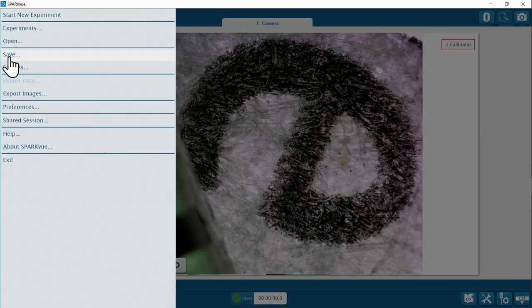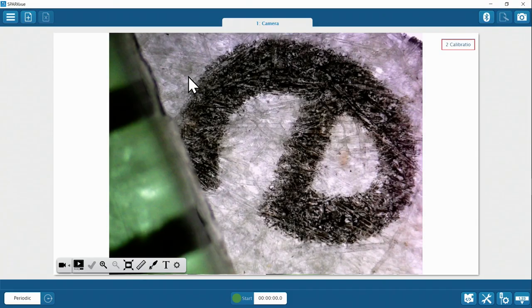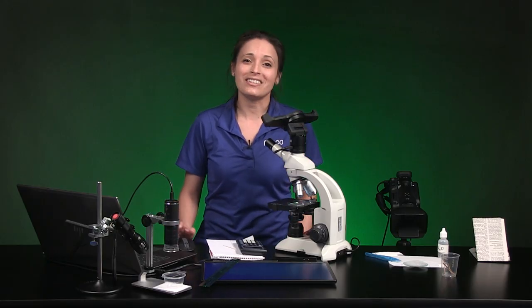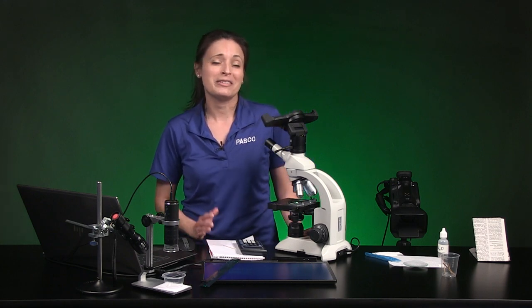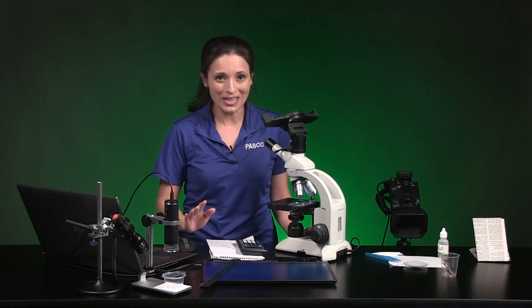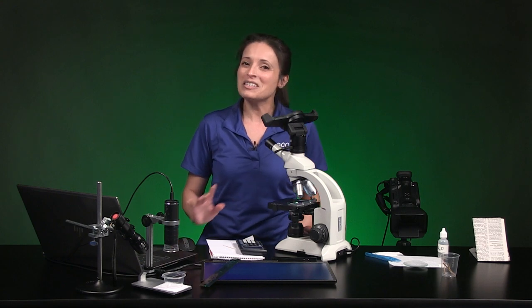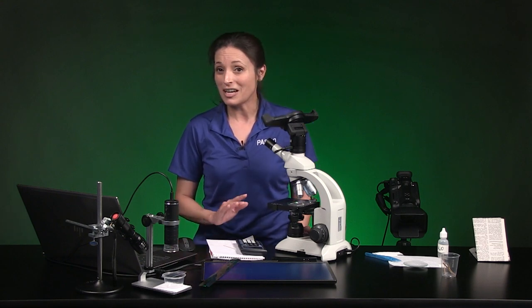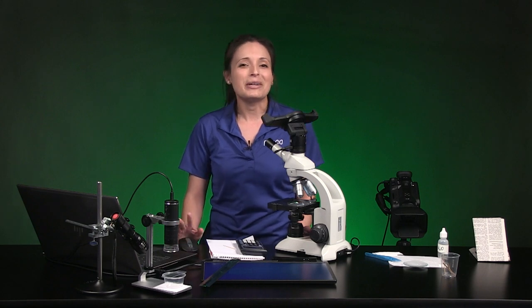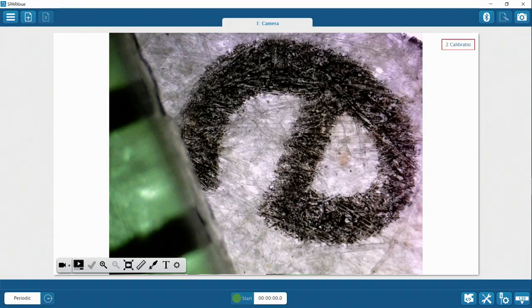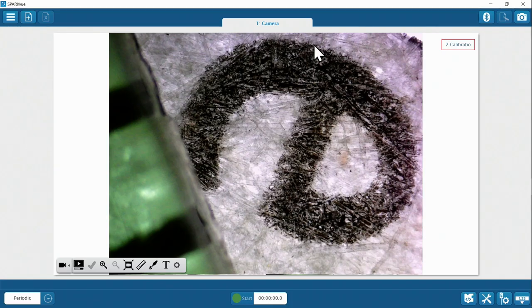From here on out, you have to open the sample data file and work in SparkView to get answers. Now we can use the millimeter distance in the still image to teach SparkView how to measure in millimeters. In the Camera Tools menu, activate the measurements tool. There's now a new menu on the left — choose the ruler icon and click near one of the millimeter marks.